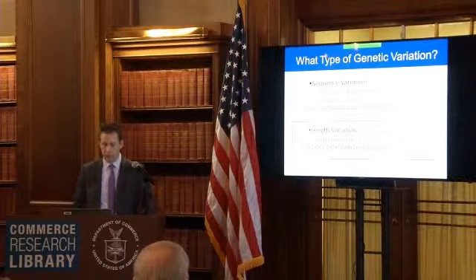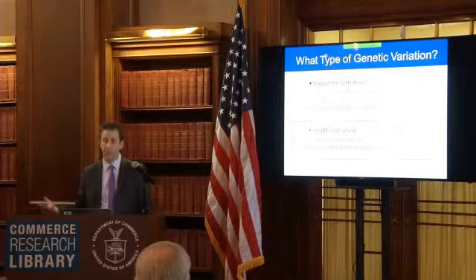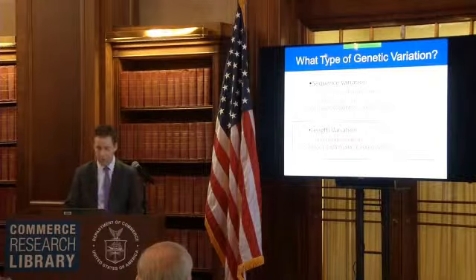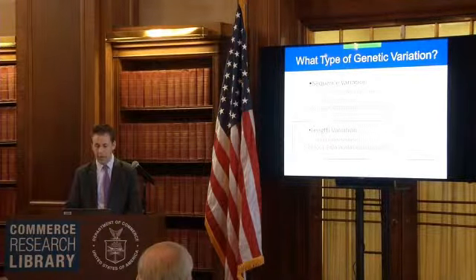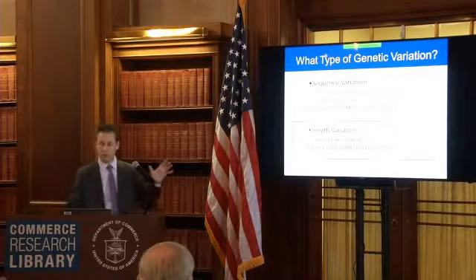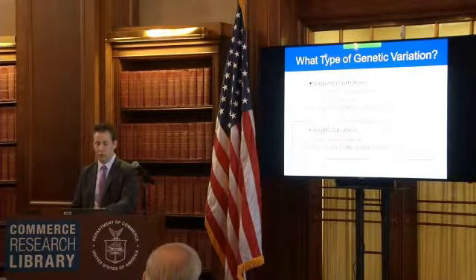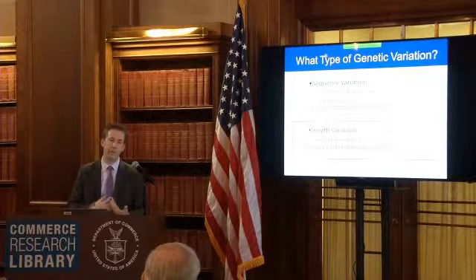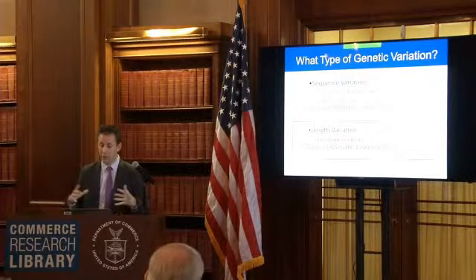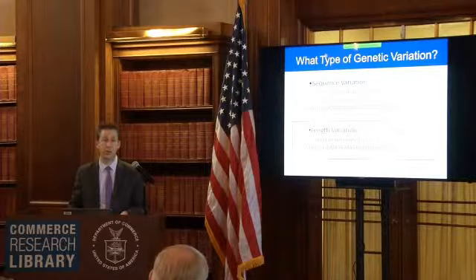So I'm going to start to get into the actual DNA typing. And one thing here is, what type of genetic variation are we looking at? I said that we're not sequencing everyone's genome, and that's what I have here on the top, which is sequence variation. The idea here, these are called single nucleotide polymorphisms. What I have here in black and underlined would be a conserved sequence, so we would all have the same sequence there, but here I have a G and an A. So one individual might be a G, one might be an A. That's a way to differentiate between individuals. And then you would go back to the common sequence. I think there's about 3 million of these SNPs, or single nucleotide polymorphisms, in the human genome out of 3 billion base pairs.